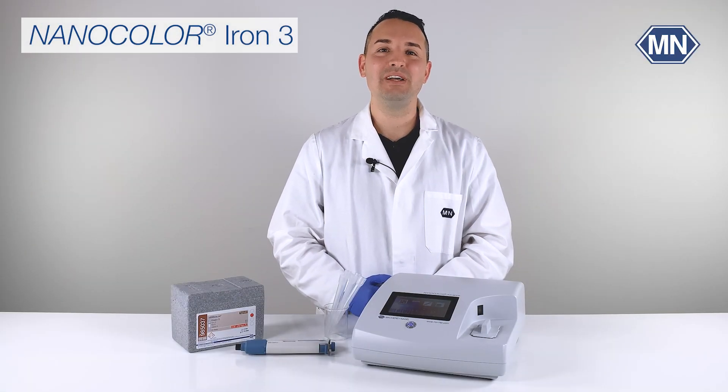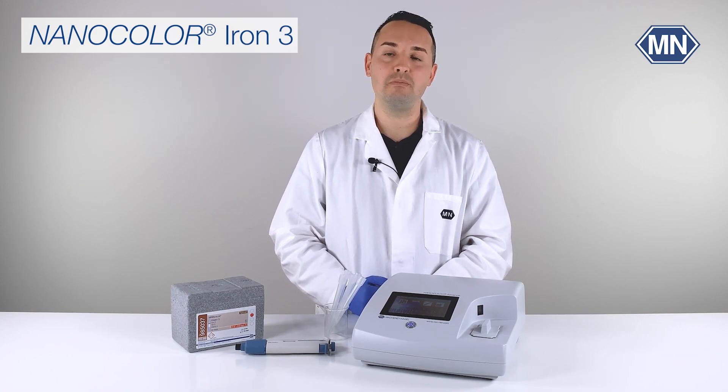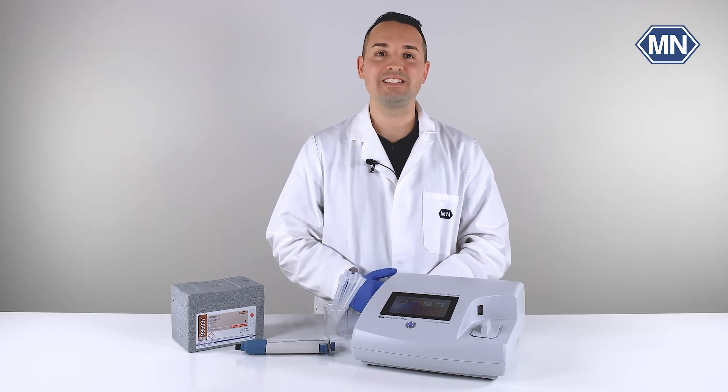Hi, my name is Manuel. Welcome to the YouTube channel of Macherey-Nagel. In this video I would like to show you how to perform the Nanocolor Iron 3 test.